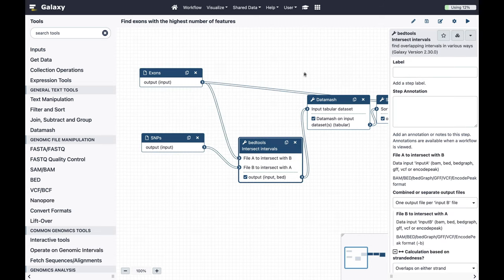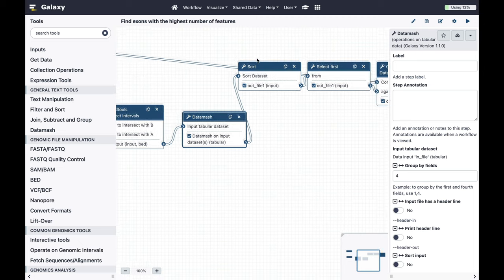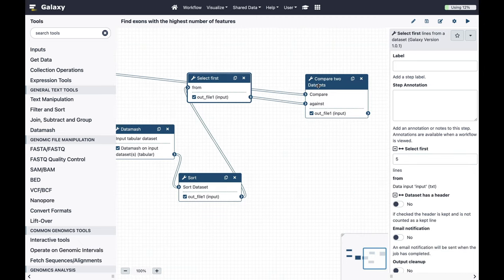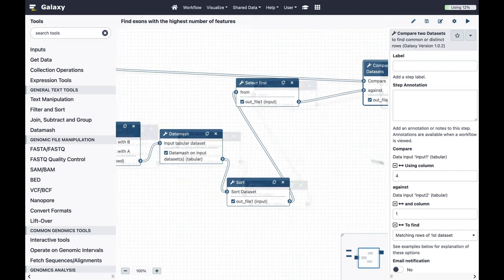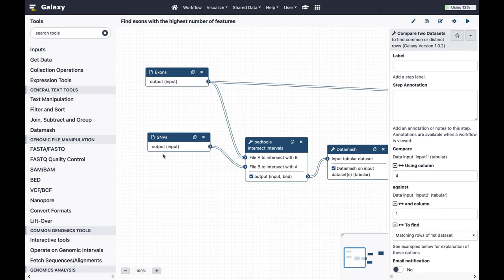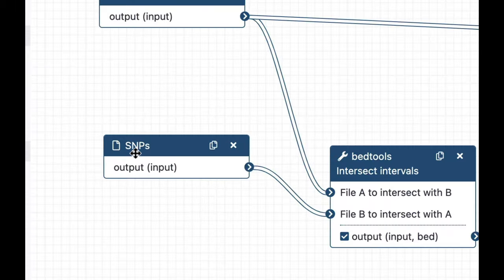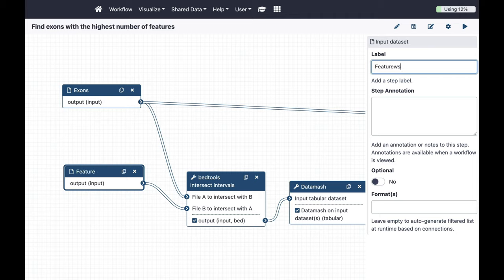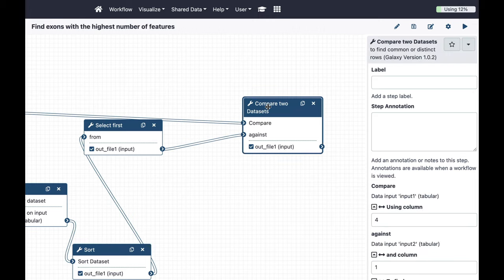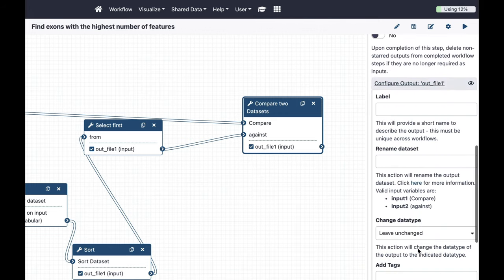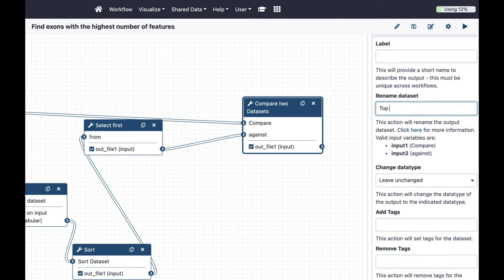In the workflow editor you can see all the nodes — these are individual tools. The output is the dataset with the top five exons, and these are the inputs. One input is called 'exons' and the other 'snips', but let's make it more generic. I'll rename it to 'features' in case we want to analyze other types of genomic features. For the last dataset I want to rename it to 'top five exons' so I can clearly see in my history what's going on.